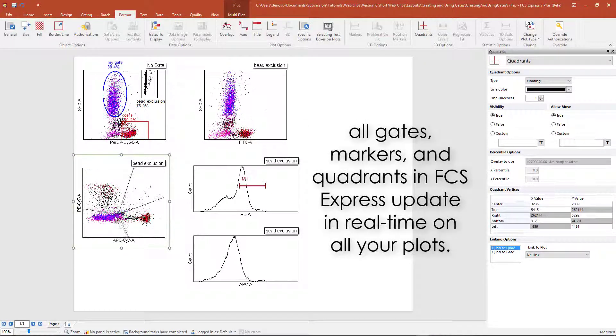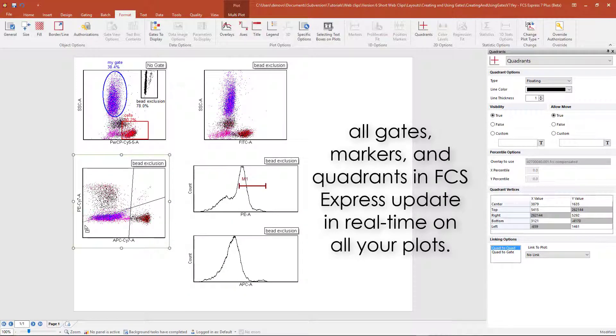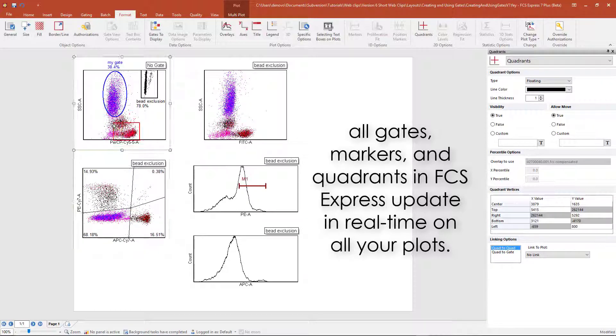Like all gates in FCS Express, the populations will update live on the plots as you move around the quadrants or gates.